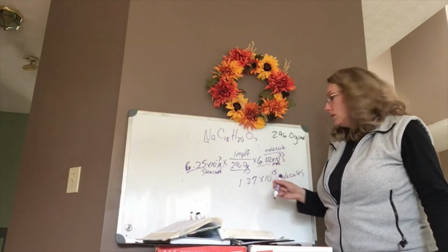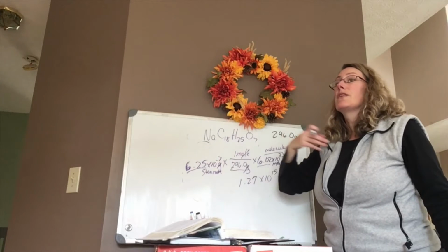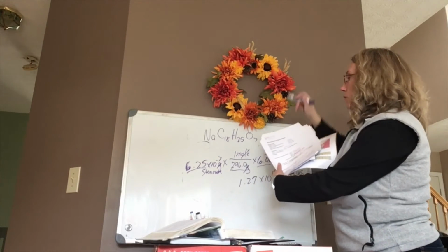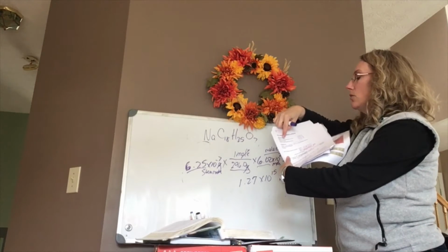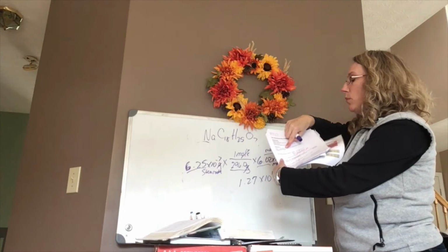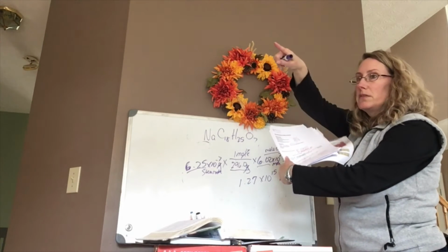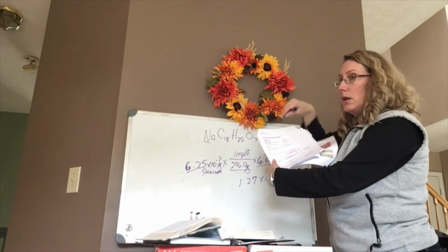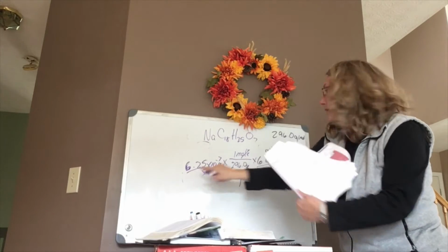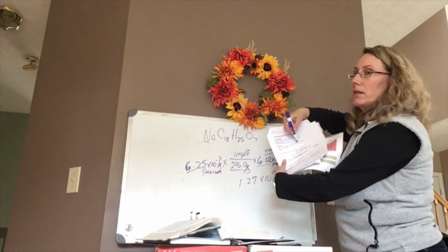Where did you get that number, the first one? This one was from when I took from this part of the calculations. When I took the weight of one drop, and I multiplied it by 0.00125, because that's how much percent of stearate soap is in my water. Oh. So your number is going to be a little bit different. Yes, yours is going to be different. It's this number right here that's on this lab.